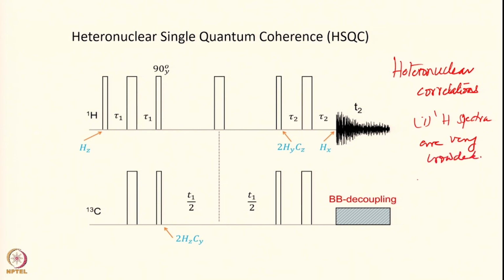And secondly, we have strong diagonal peaks in proton-proton spectra. But the information which we are using is only the cross peak information. The cross peak information is what we want. So, can we limit this only to the cross peaks? Surely you can limit it.